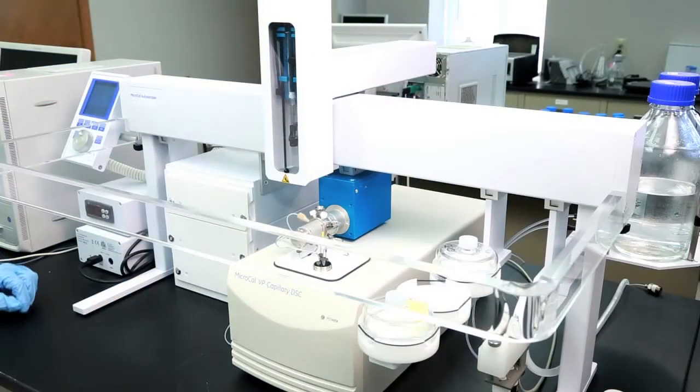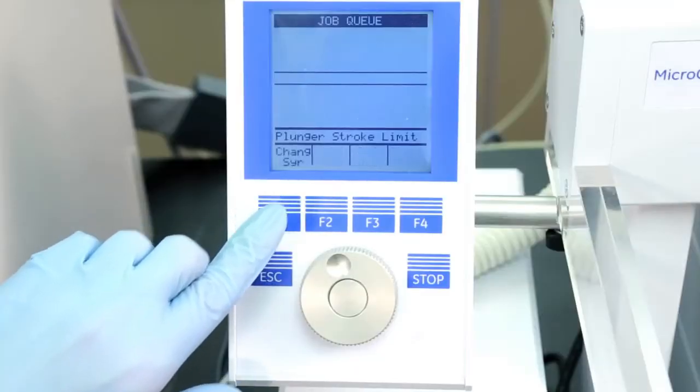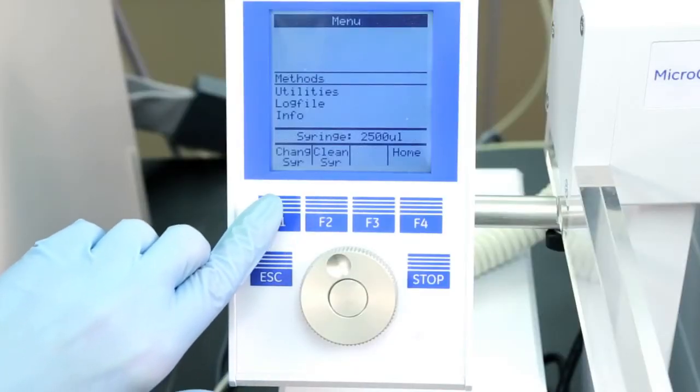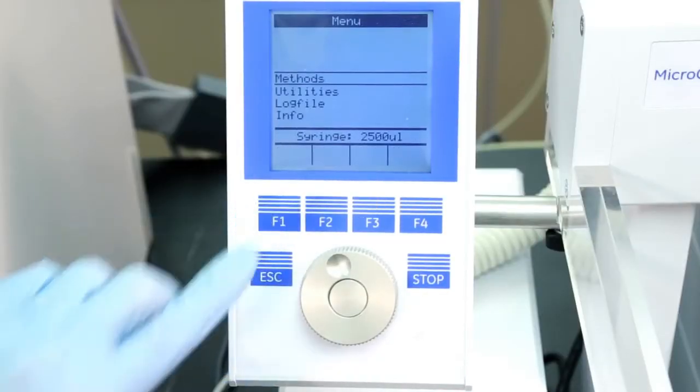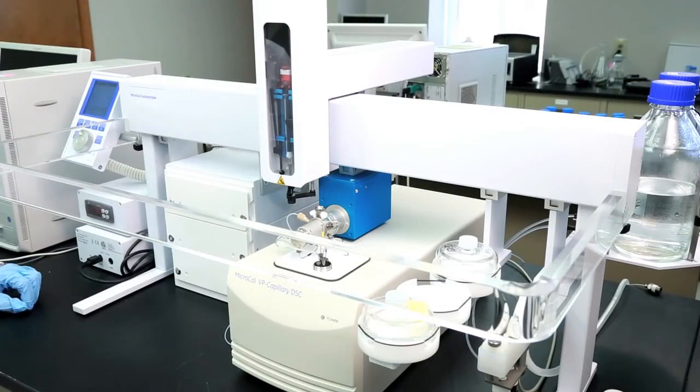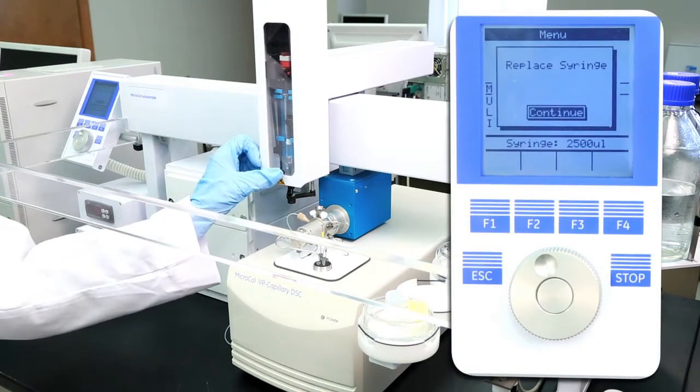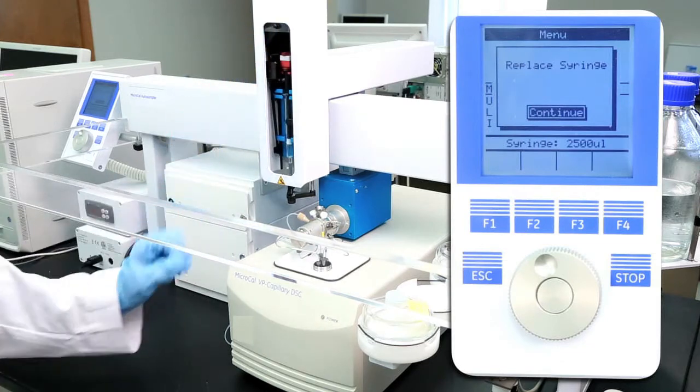To remove the syringe you first have to get it in the appropriate position. Press F1 on the console of the auto sampler and then F1 again to change syringe. The syringe will then move to a position where you'll be able to remove it. You open up the sliding door to access it.